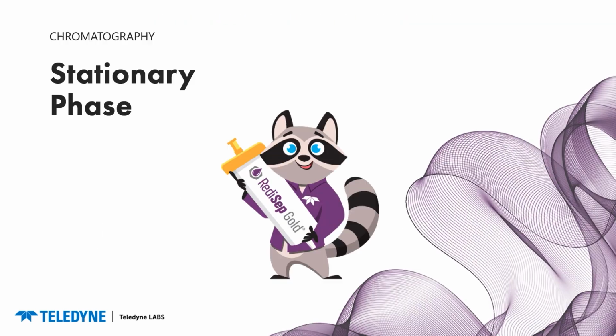Now that we have a good understanding of what flash chromatography is and how chromatography works, we can finally get into our top 5 essentials for maximizing success in flash chromatography. And I know you guys have all been dying for this moment. So we're going to start off with our first essential, and that's going to be our stationary phase.